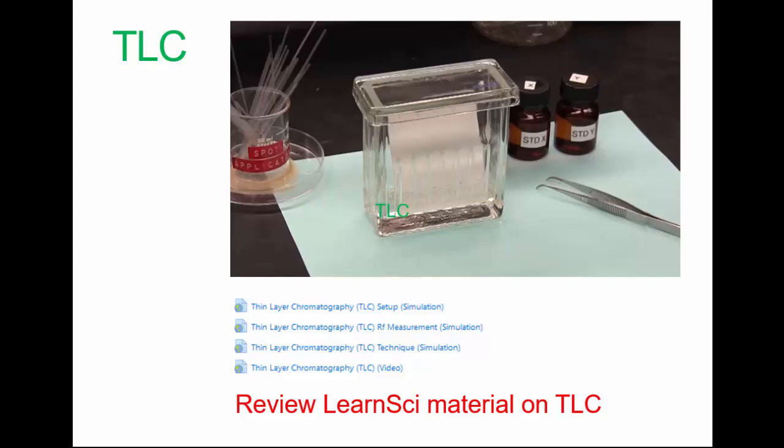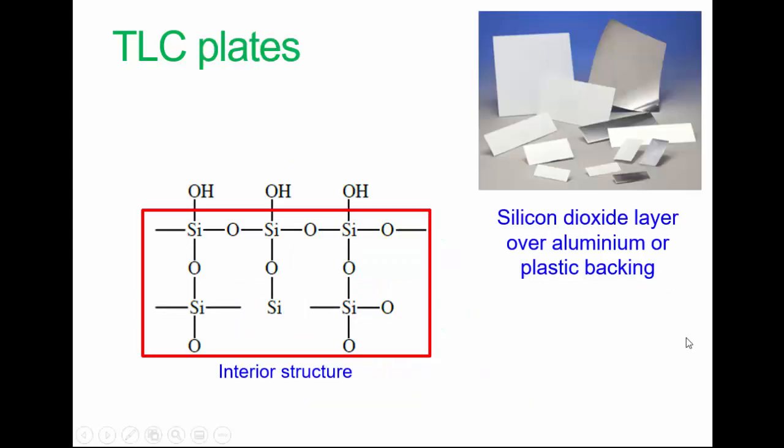This video makes the process look quite straightforward. It does require quite a lot of skill, however. In particular, successfully producing a small concentrated spot of sample needs practice. This is quite important. If the spot is diffuse, poor results will be obtained. So have a look at that video there. Well worth having a look at.